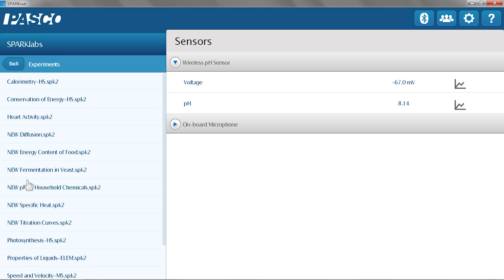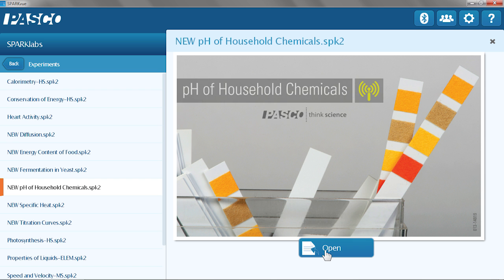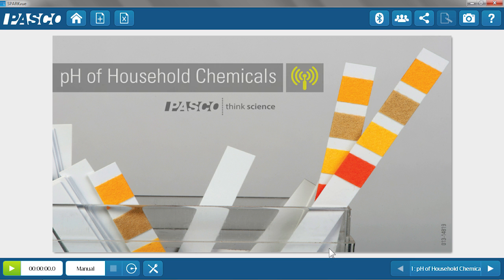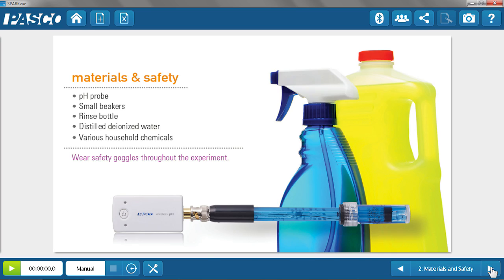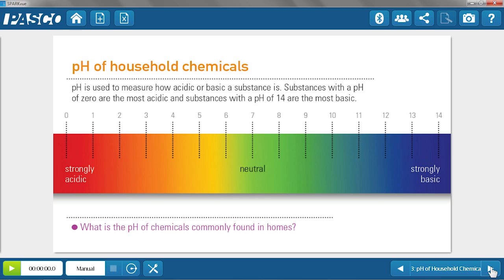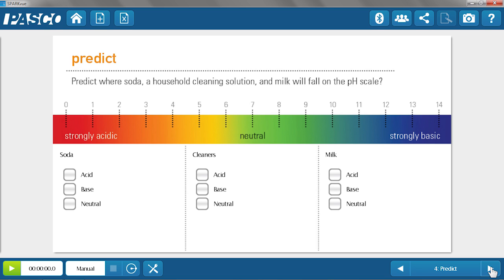So I'm going to hit Experiments. I'm going to hit pH of household chemicals. I'm going to hit Open. And the great thing about the SparkLabs is it gives the students some more structure and background. It tells them about the materials and safety information, some theory about pH, a little bit of a prediction question to get their minds thinking about what should be happening or what they can expect.